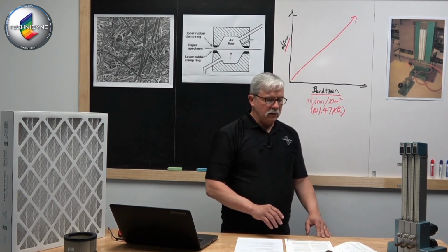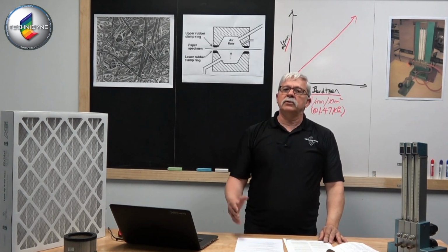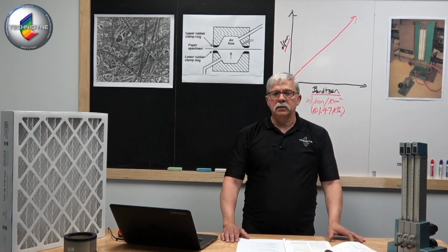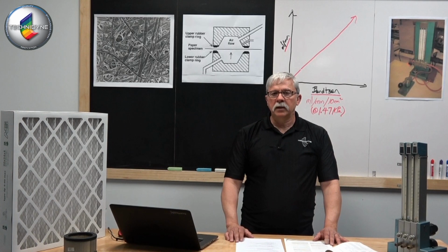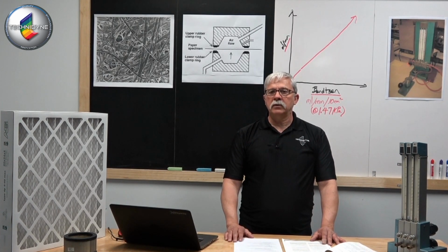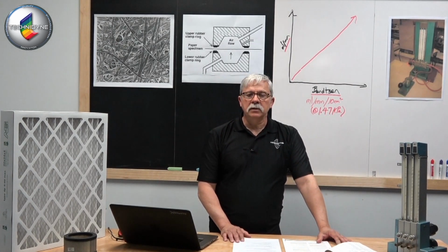So we've got the basics of the Bendtsen instrument. Again, just to give you an idea of where some of these results are coming from, especially if you're new to the industry and you haven't seen some of this other instrumentation here in North America. There aren't a lot of these units that have been purchased in laboratories, but to give you an idea of where this number is coming from, hopefully I've given you a quick overview and you have some basis to compare to.